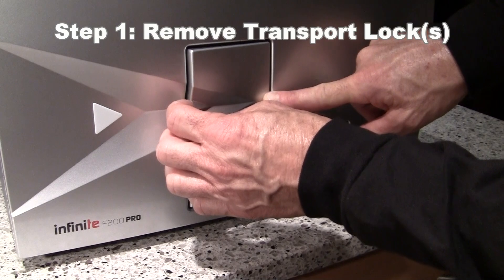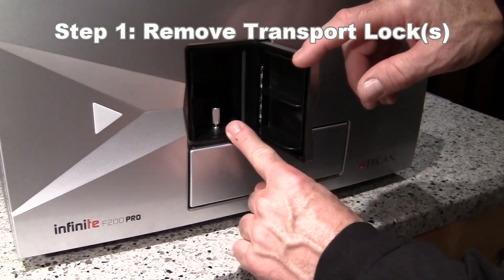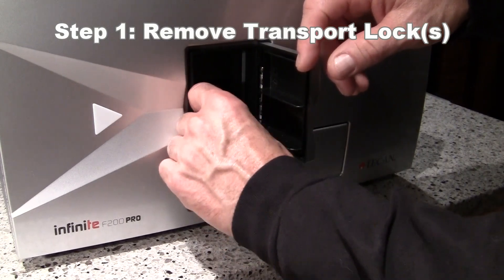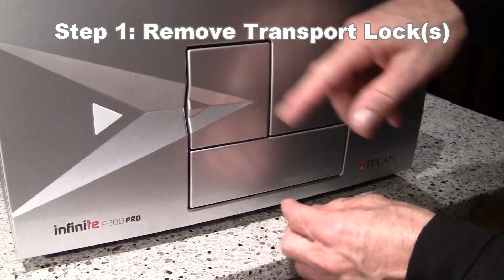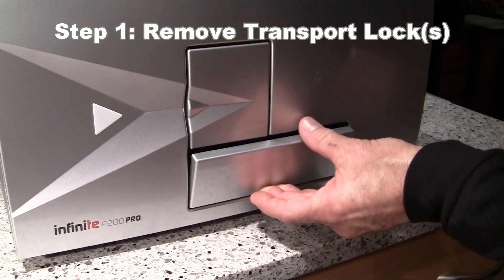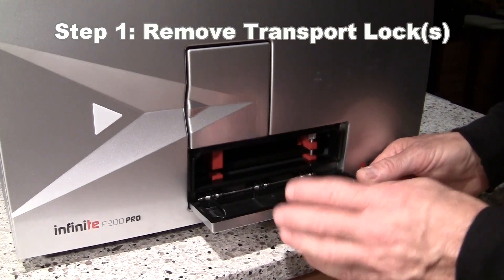You will first need to remove the screw that holds the left transport lock and open this small door. Turn this screw counter-clockwise and lift it out when it's loose, then set it aside. Press with your fingers against the bottom of the door, hinging it open, and gently open it without putting too much downward pressure on the door.